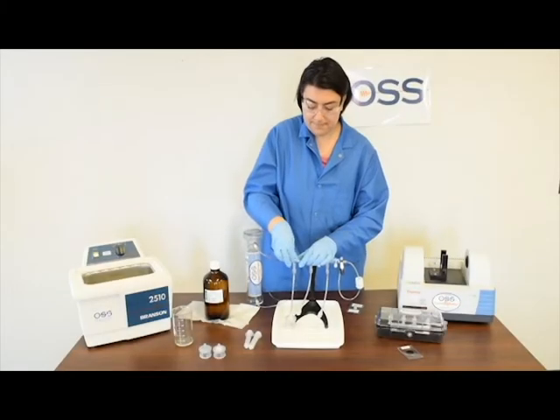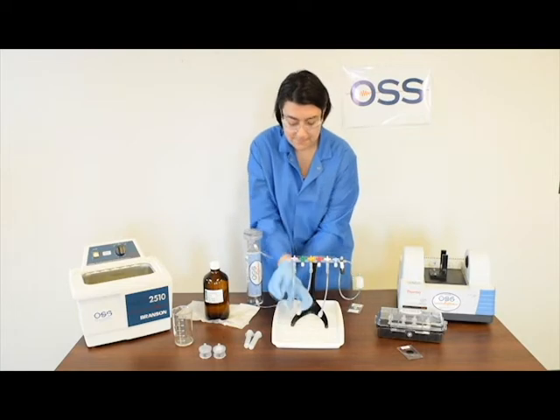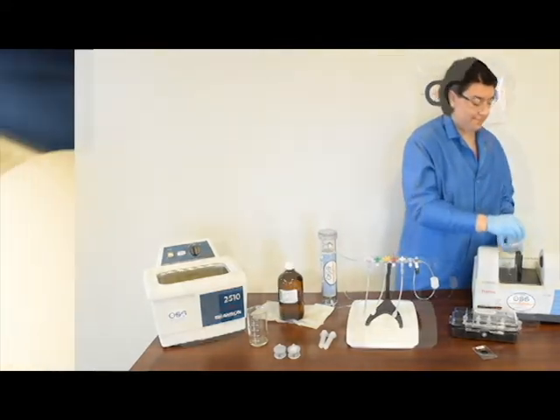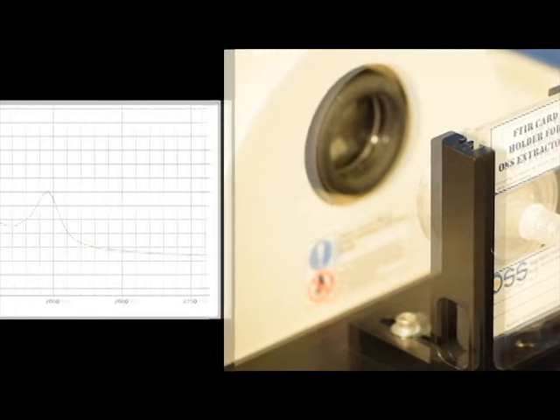Once aligned and calibrated, the processed extractor is analyzed for total oil and grease. OSS has developed a convenient macro for select FTIR manufacturers' software, which will walk you through the process step-by-step and provide the final concentration.